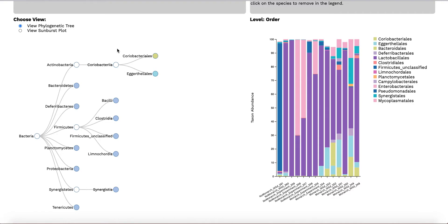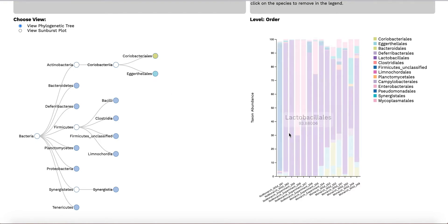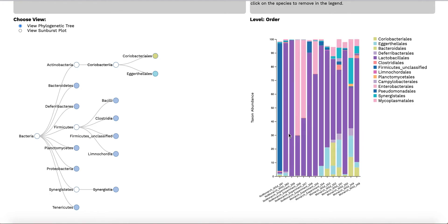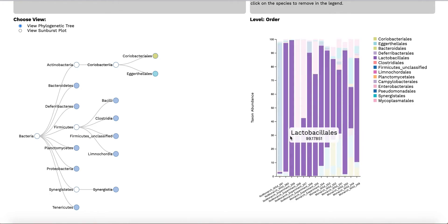Nodes at the deepest level are colored to match the corresponding bars in the stacked bar chart. Mousing over a bar highlights that species in every sample so that you can see the differences easily.